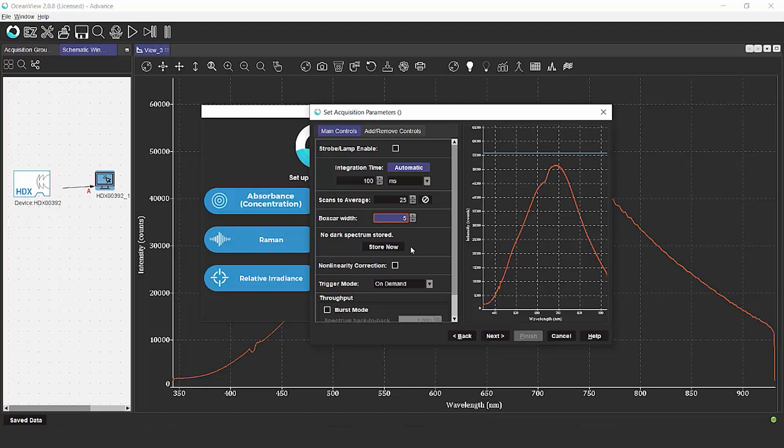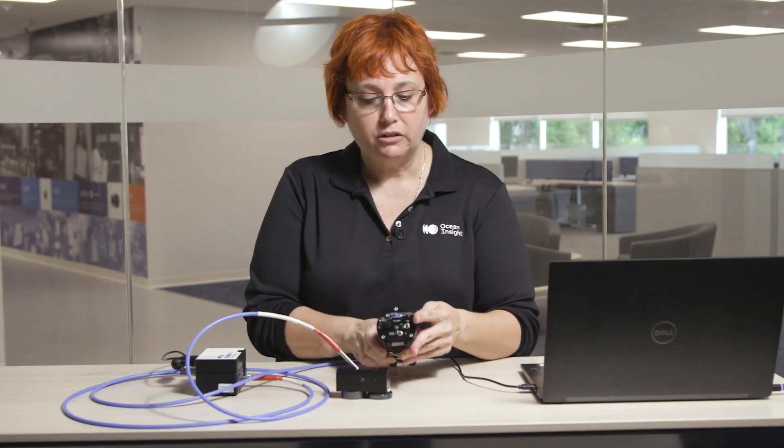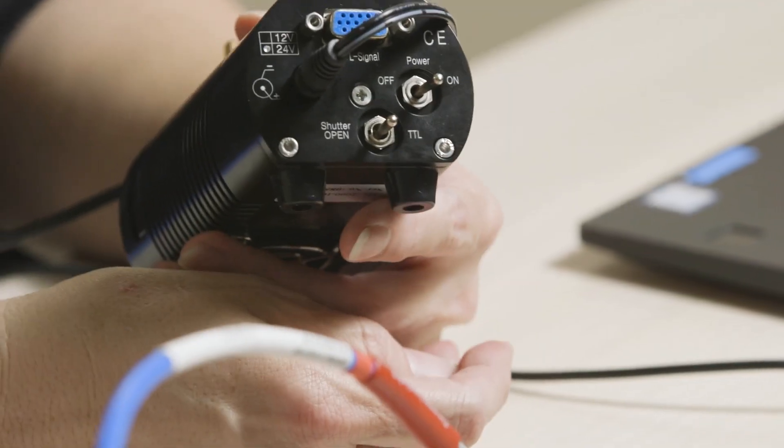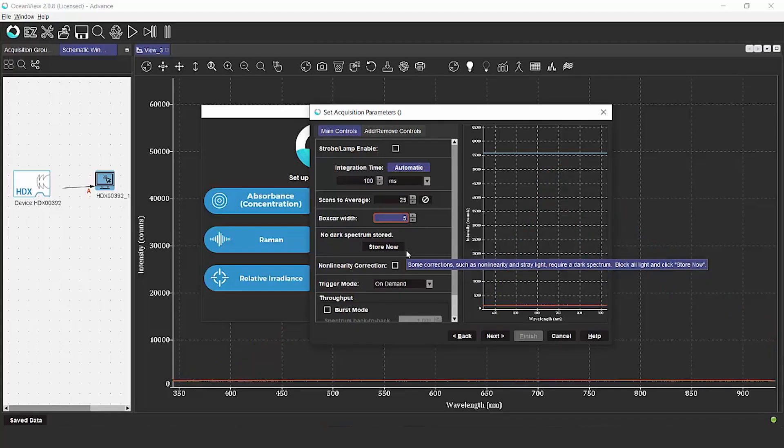The next step that the wizard will ask you to do is to store dark spectrum. We're going to close the shutter on our light source, so no light is getting into the spectrometer.